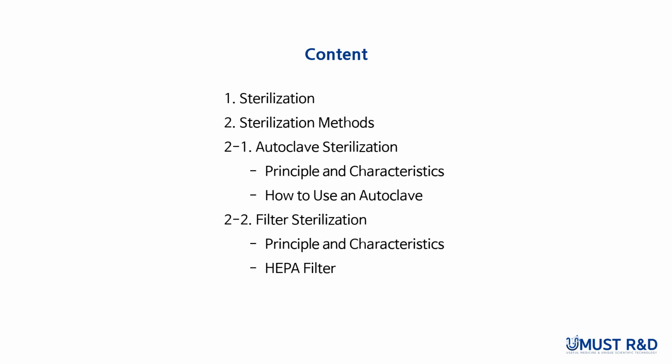First, we will define what sterilization is, and then we will discuss two common sterilization methods, autoclave and filter sterilization. We will learn about the principles and characteristics of each method and focus on how to use the autoclave and study HEPA filter or filter sterilization.